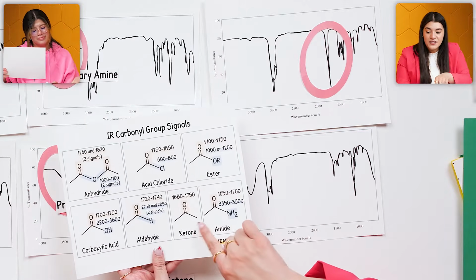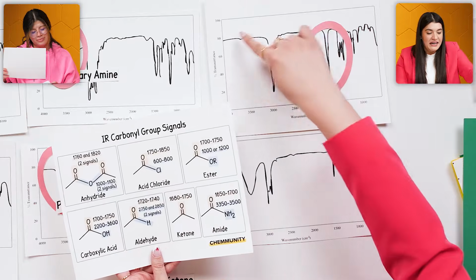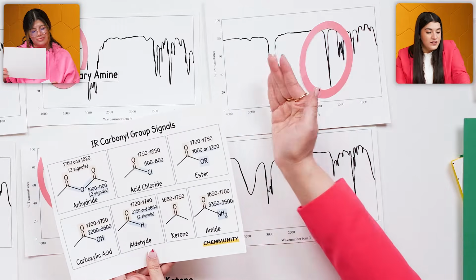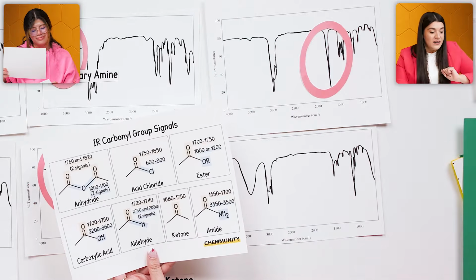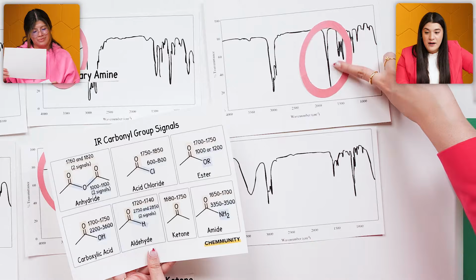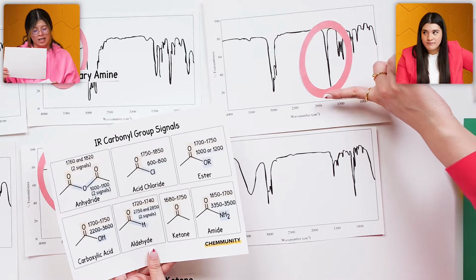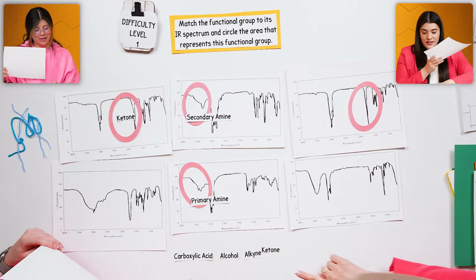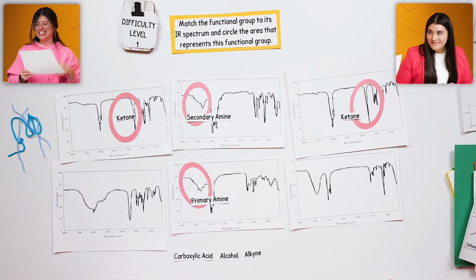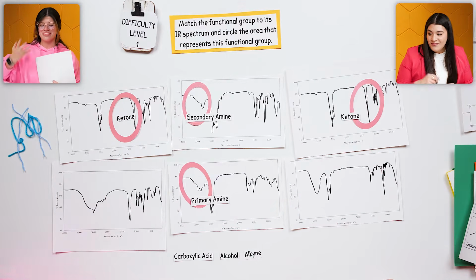There's nothing else attached. There's no OH, so I can't state that that's within that area, which would have been between here. There's nothing there. The only main thing that I look at is this really strong peak. And by strong, I mean it's long. So let's label that and state it's another ketone. And we just did that. That's so silly. Now that makes sense.